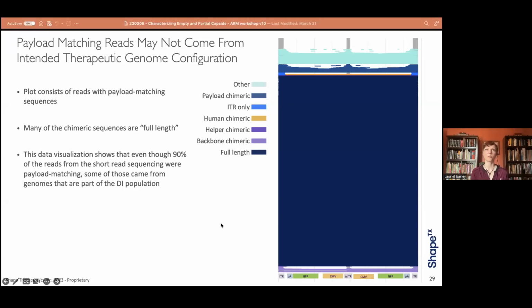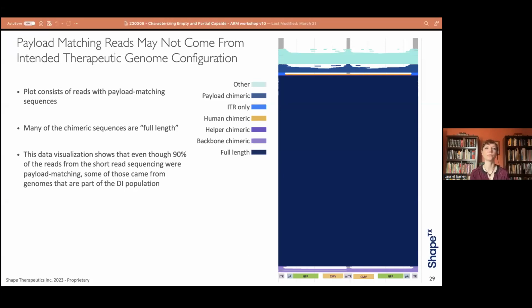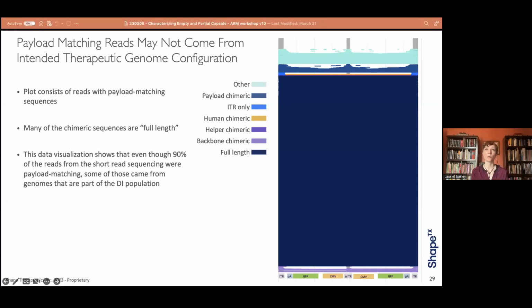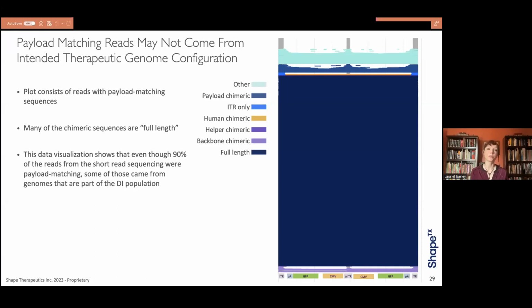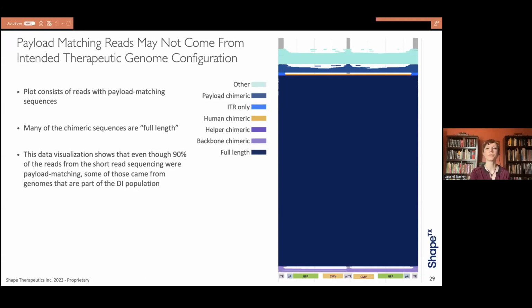And so this is giving us more insight into the structural information around where some of these contaminant genomes are coming from. And I'm going to emphasize again here that even though these are a very small portion of the population, some of these non-payload species are very long and could be considered full length. And so they would be very difficult to remove with current purification technologies that often go based on density or size of the particle or charge. So I think these are important to characterize in your prep.